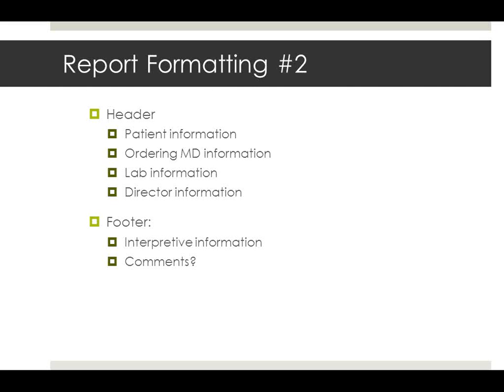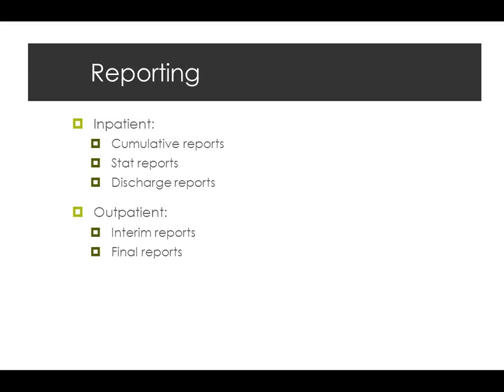So instead of putting a big comment on something, or a lot of our normal ranges where I've got to give you kind of a table like on cholesterols. This is desirable, this is borderline, this is out of range, and I'm going to give you all that information. Rather than put it in the body of the report, we footnote it so that you can refer to it, but it's not cluttering up the report itself.